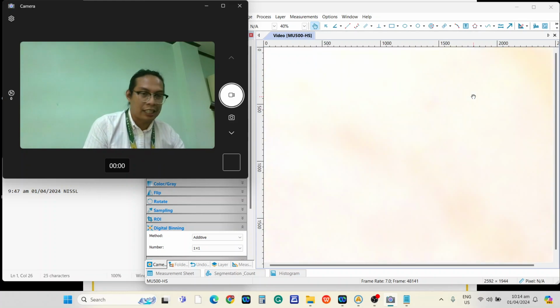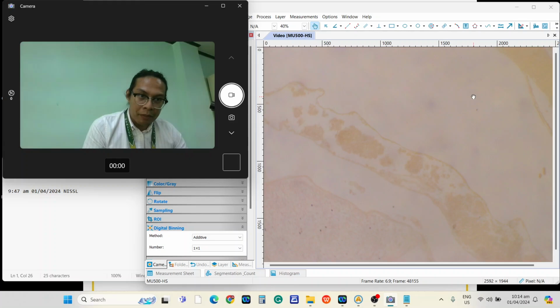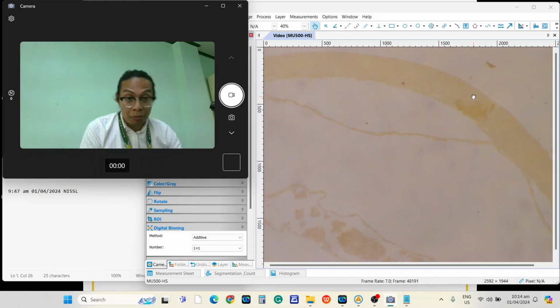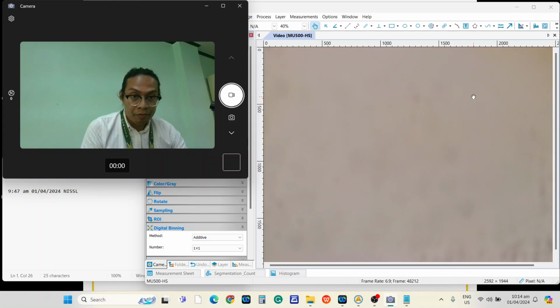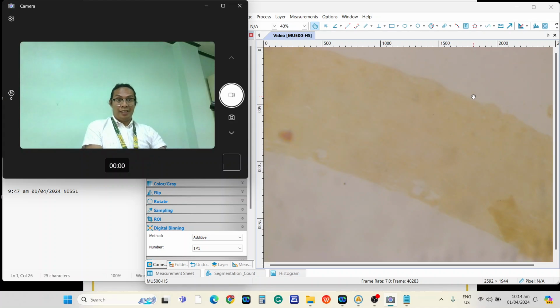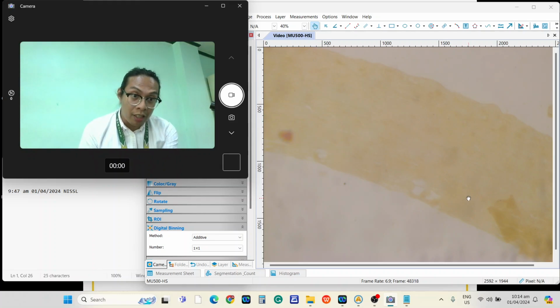Kung titingnan natin siya, hopefully, kita pa natin ang mga fibroblasts, fibrocytes. Yan. Dito yan. So, as you can see, hindi natin gaano ma-appreciate. It is made up of collagenous fibers. Okay? So, it runs parallel to the dura mater. Okay, so that is the dura mater.